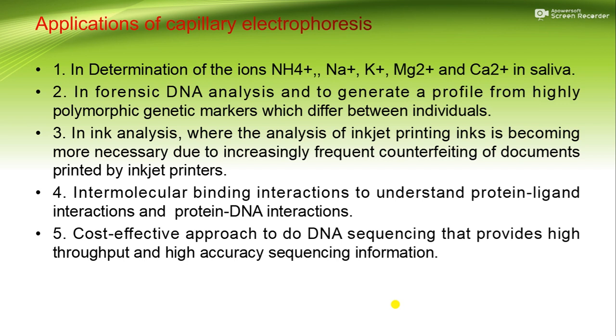Applications of capillary electrophoresis. 1. In determination of the ions NH4+, Na+, K+, Mg2+, and Ca2+ in saliva. 2. In forensic DNA analysis and to generate a profile from highly polymorphic genetic markers which differ between individuals. 3. In ink analysis, where the analysis of inkjet printing inks is becoming more necessary due to increasingly frequent counterfeiting of documents printed by inkjet printers.